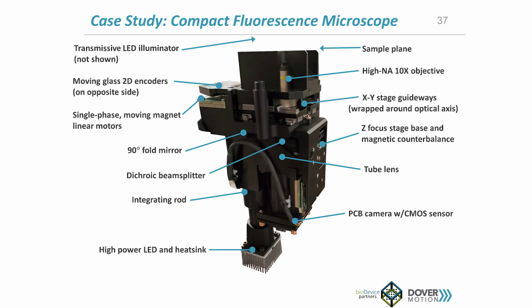So the whole thing ended up being sort of, you could hold it in the palm of your hand, very high performance. And this took advantage of the modified focal length tube lens that was mentioned earlier, and as a result, developed enormously higher fluence at the sensor than would otherwise have been the case. And in fluorescence microscopy, fluence at the sensor is critical.